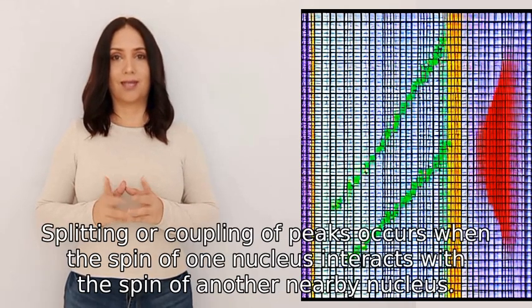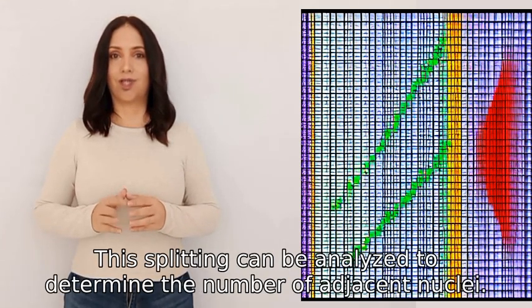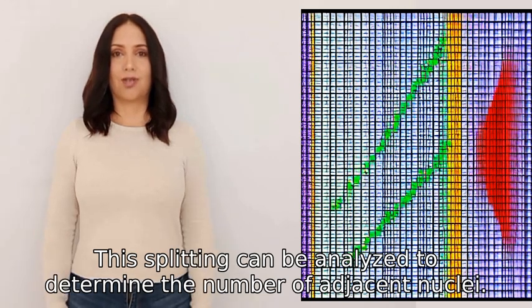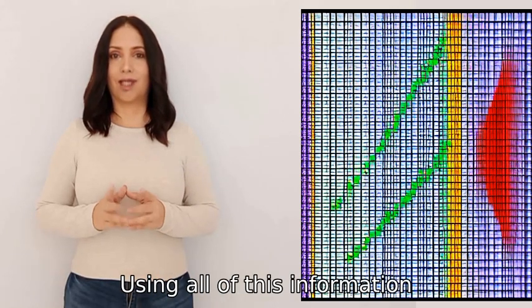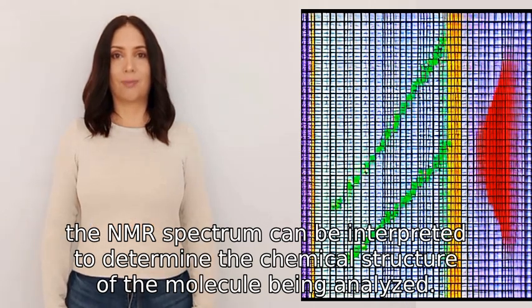This splitting can be analyzed to determine the number of adjacent nuclei. Using all of this information, the NMR spectrum can be interpreted to determine the chemical structure of the molecule being analyzed.